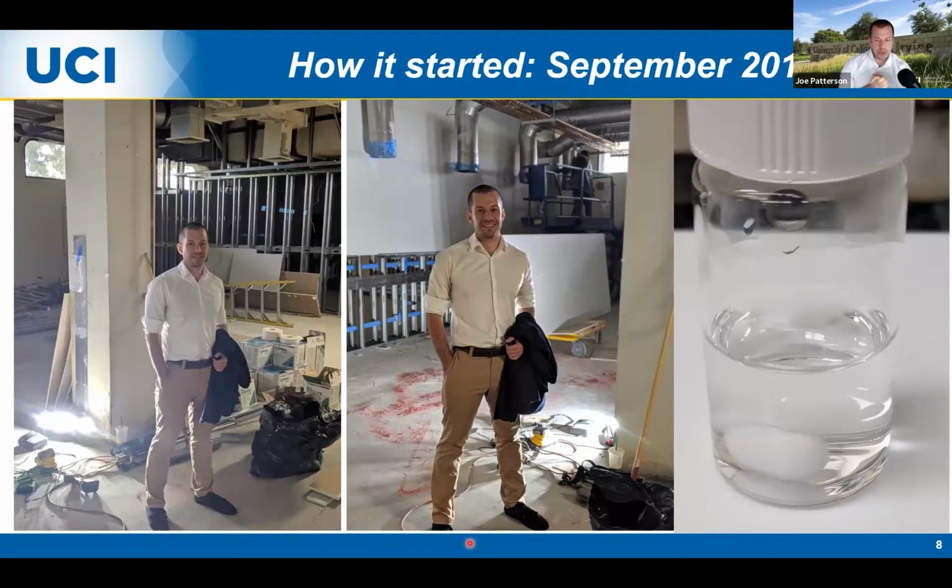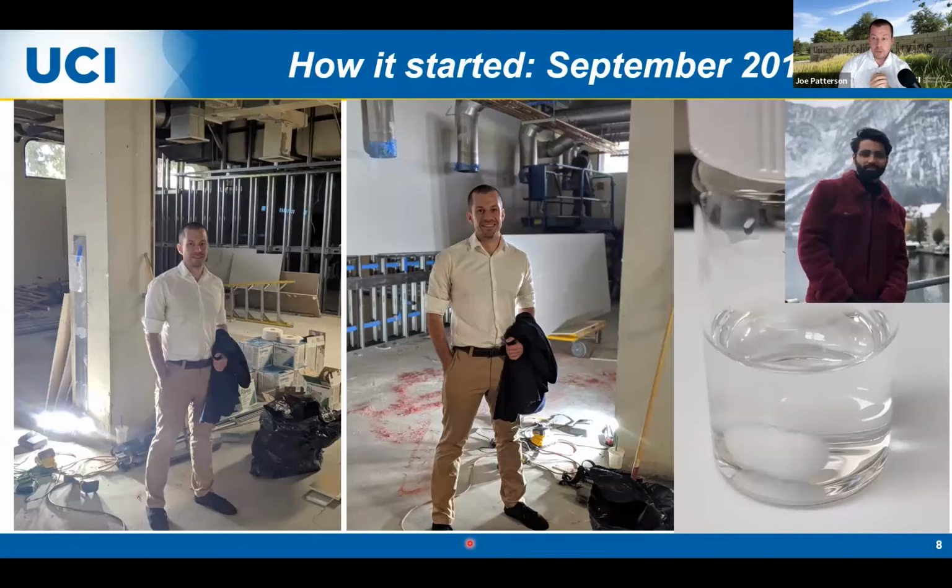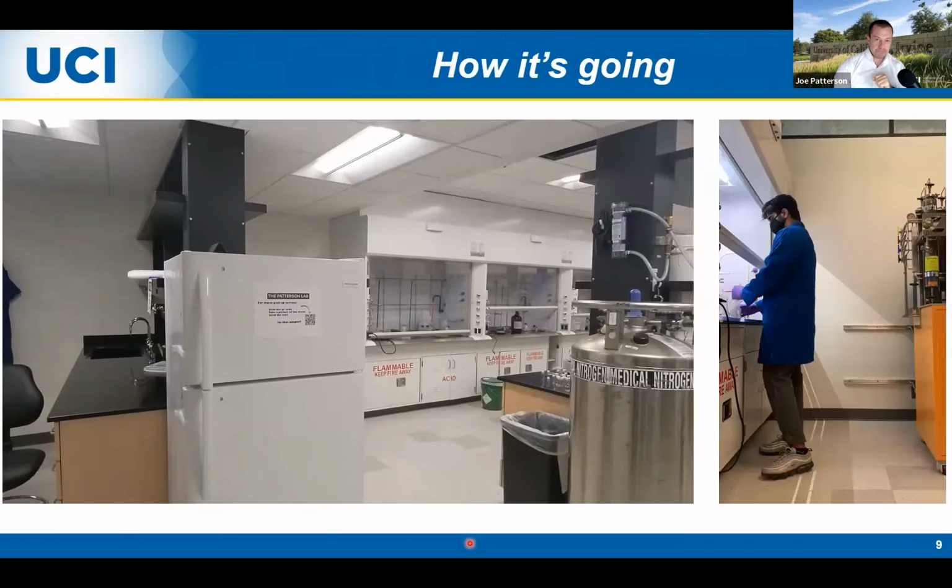This is the first experiment that we did at UCI. This was actually done by one of my graduate students. There are some block copolymers inside this vial getting ready to self-assemble themselves into nanostructures. And we actually couldn't even do this in my lab because it wasn't ready yet. But one of my colleagues, Professor Ken Shea, was kind enough to let us set up shop in the corner of his lab. And that was our home for a little bit when we started.